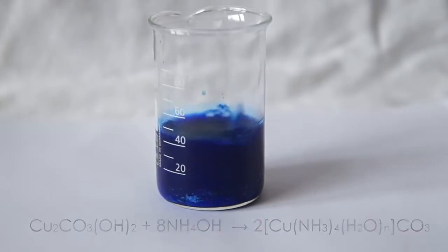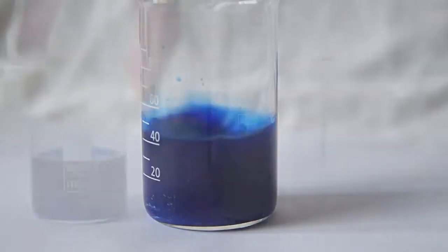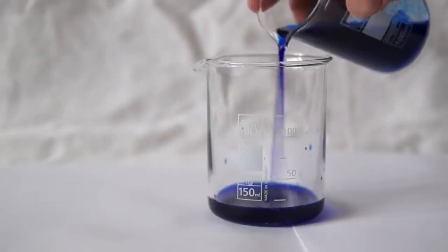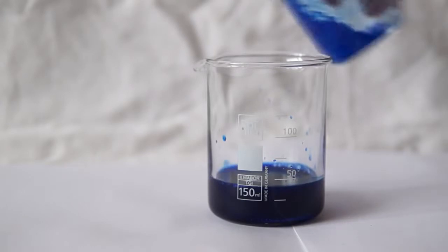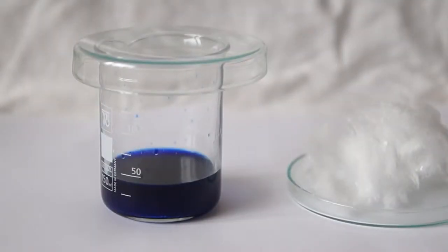However, copper carbonate doesn't entirely react with ammonia and a little residue remains at the bottom of the cup. Let's pour the liquid into the other beaker for the solution to become clear. Now we have a copper complex compound which has very interesting properties.